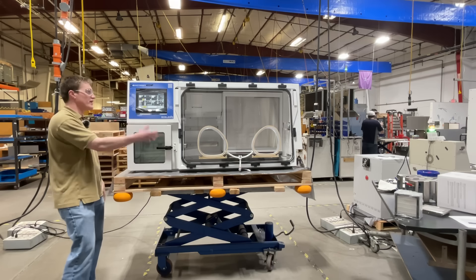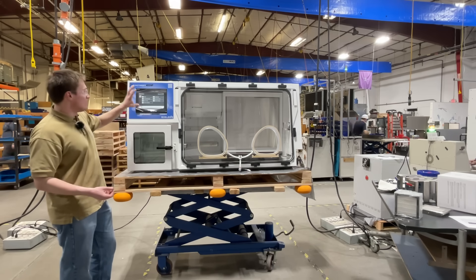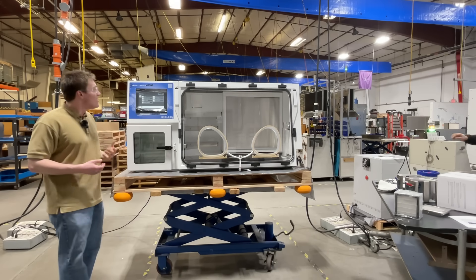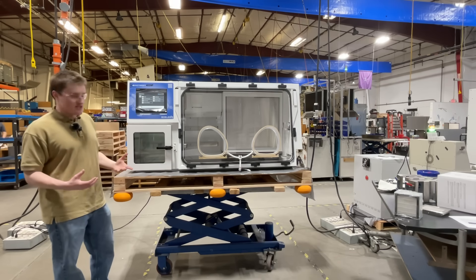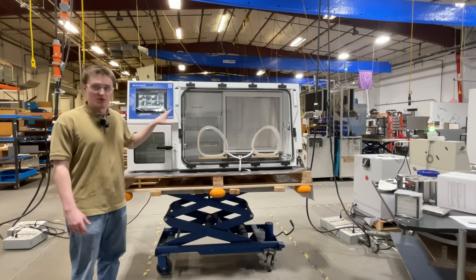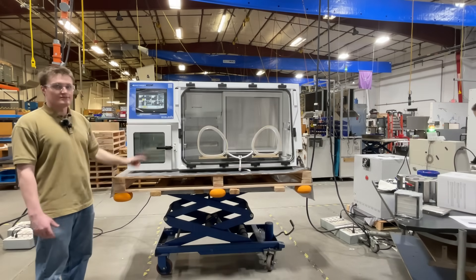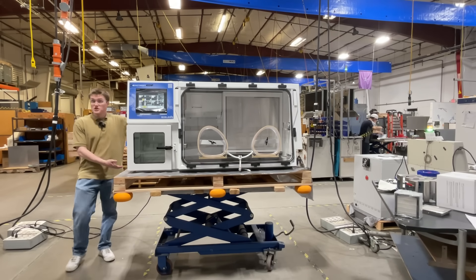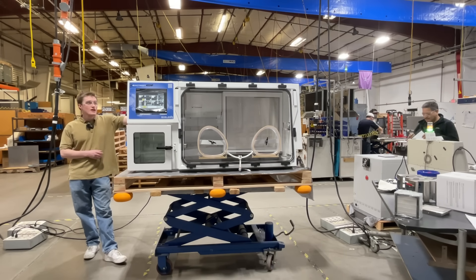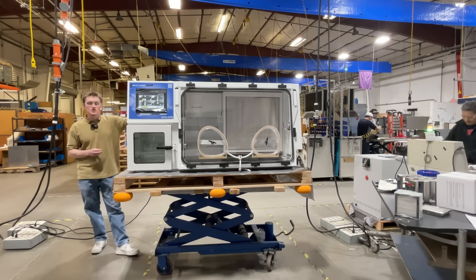Additionally, you will see various warning symbols that are detailed in our user manual, as well as full settings pages where you can find information about the unit such as serial number, firmware number, etc., and change things such as data log settings. Last, this unit has a freely adjustable light assembly using this button on screen. Anaerobic workstations like the Bactron 400 HP are invaluable tools for ensuring precise and contamination-free research environments. By maintaining a stable, oxygen-free atmosphere, these workstations enable groundbreaking research across diverse scientific fields.